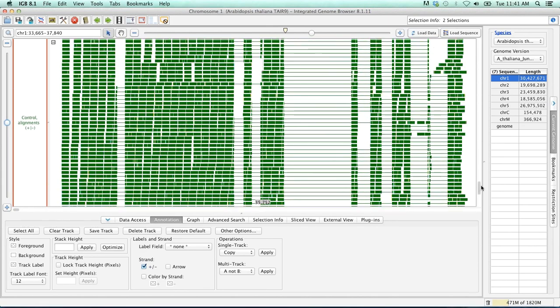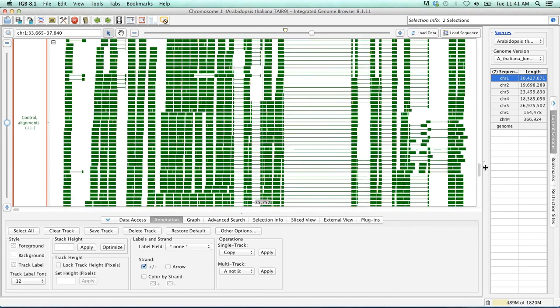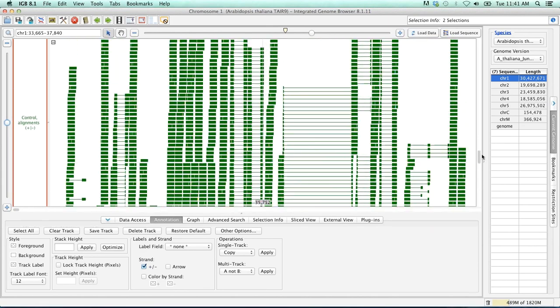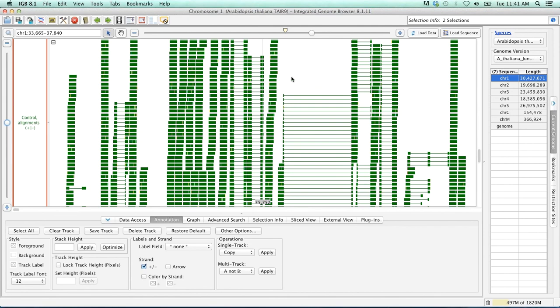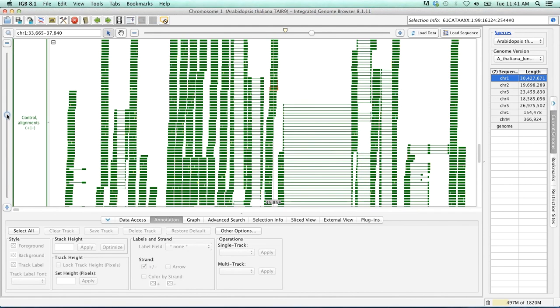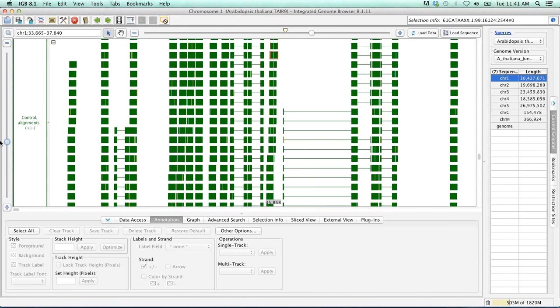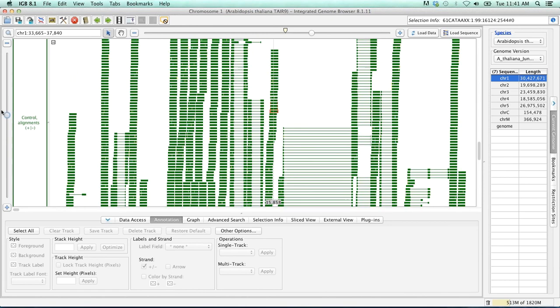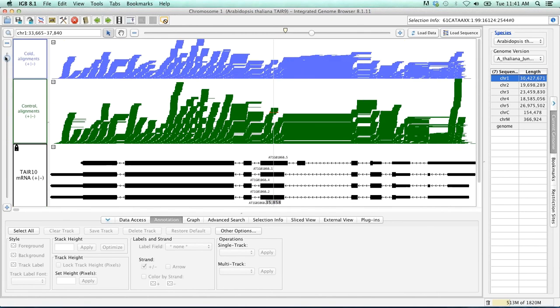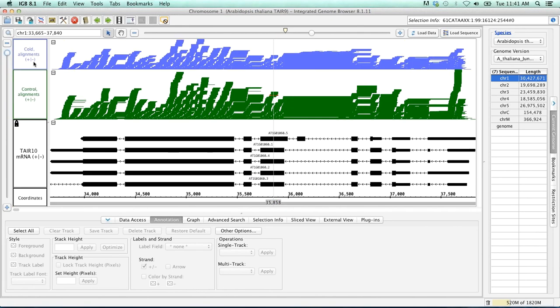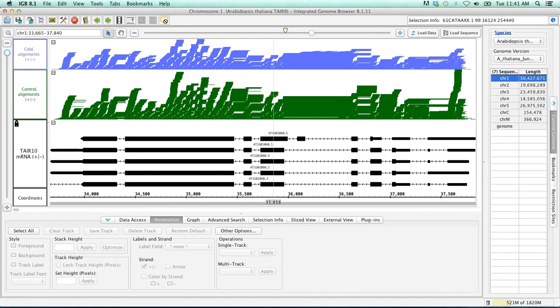This will give us a zoomed in view showing all the different reads within this region. Here we can see we have some interesting reads here, some more here, and doesn't appear to be any there. So there's nothing here. Quite interesting. Of course, this is a lot of data and it's a little hard to visualize, though it does a very good job of zooming in so we can expand these regions more or less.